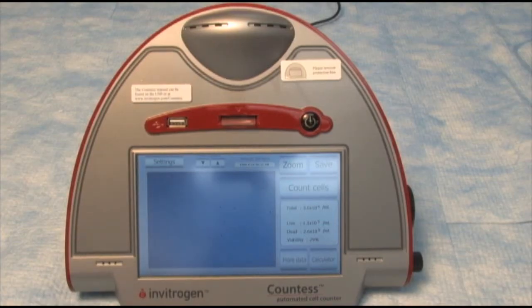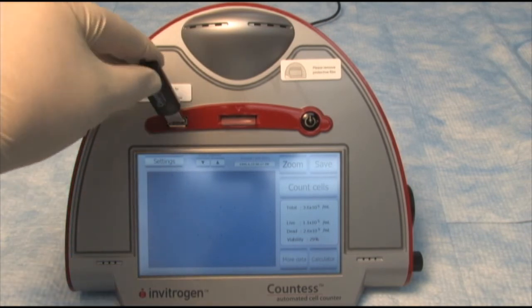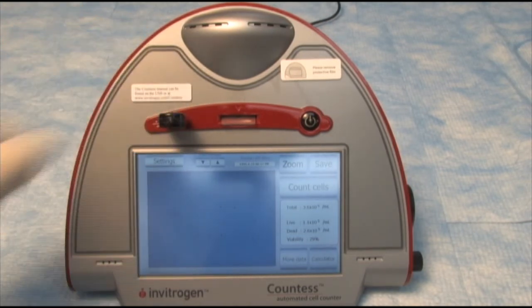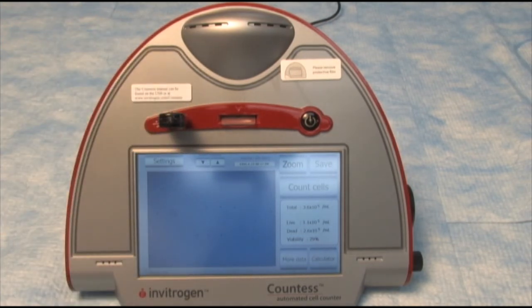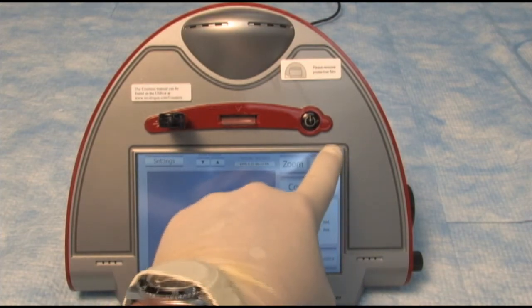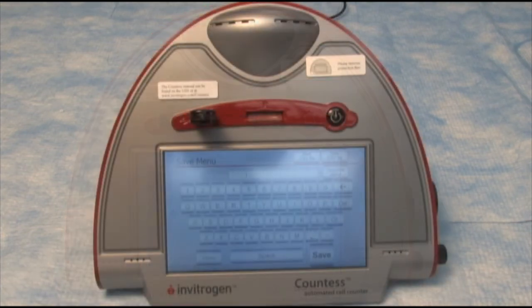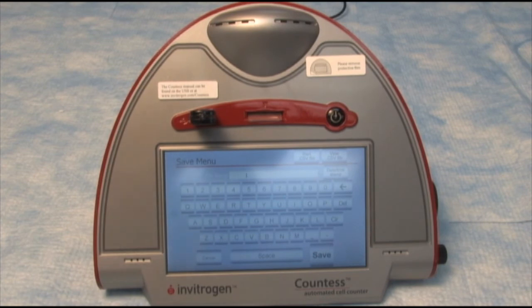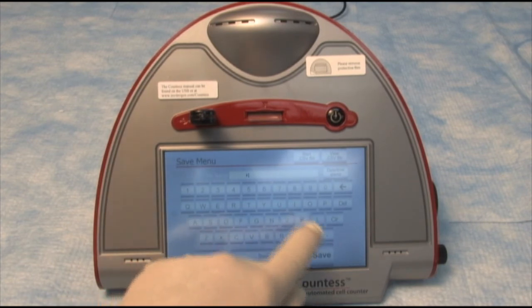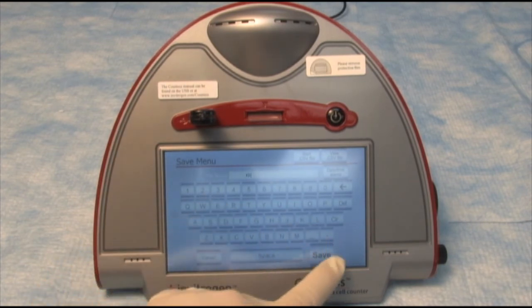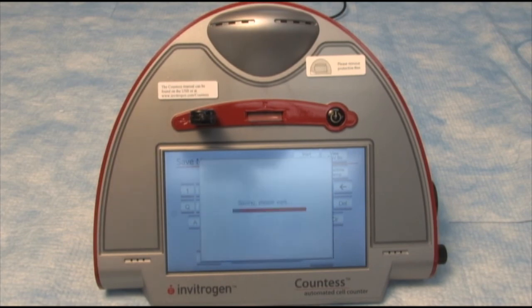After I'm done, I can put in USB drive into the drive slot and hit save. It will let me name, hit save.